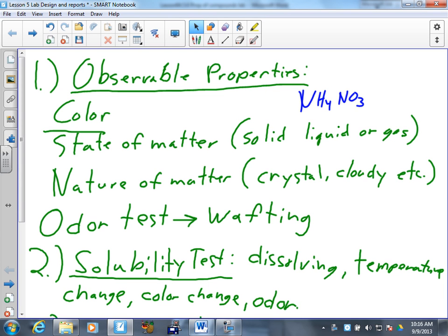You want to make observations of color, because color will tell you most likely the identities of 3 of the unknown substances. One of the unknown substances is copper 2 sulfate. One is nickel 2 nitrate, and one is cobalt 2 chloride. Will you be able to identify those with fair certainty right off the bat with this test? Yes, because their color is indicative of what they are.